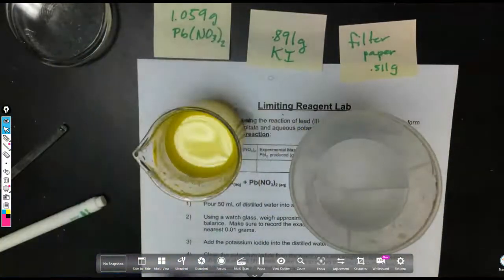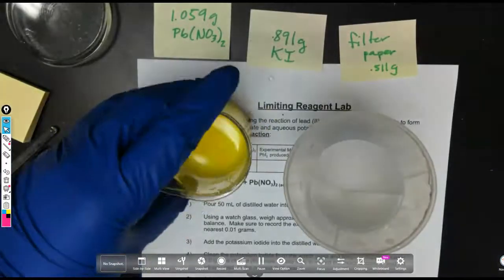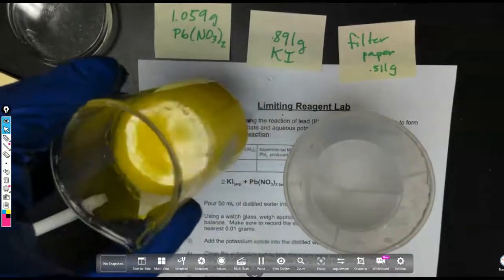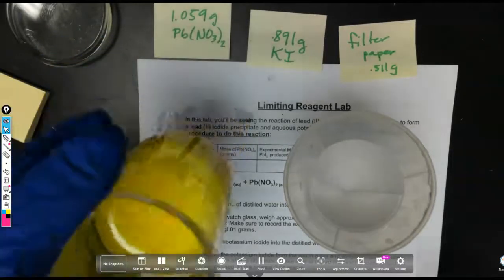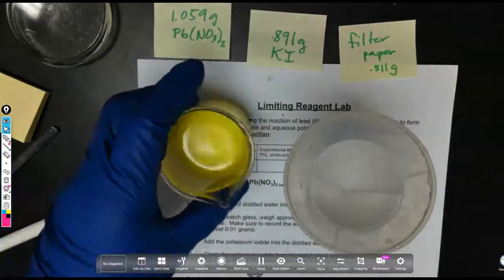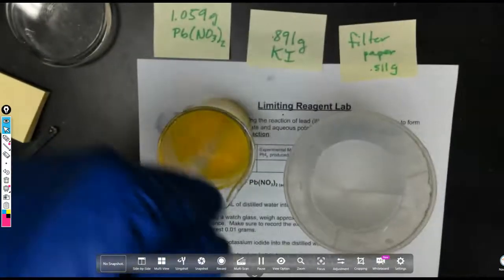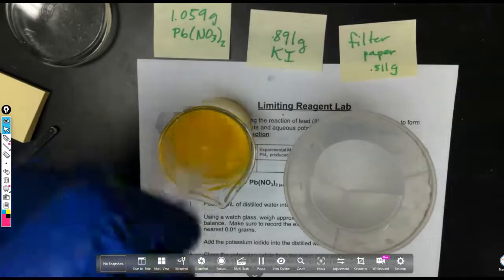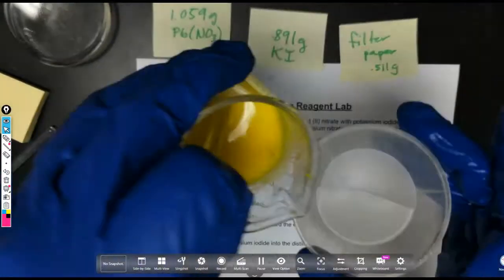So what I'm trying to do is a physical filtration process to remove the solid precipitate from the liquid solution. And I am going to go ahead and stir that back up again because I want as much of the solid to be into the filter paper as possible.